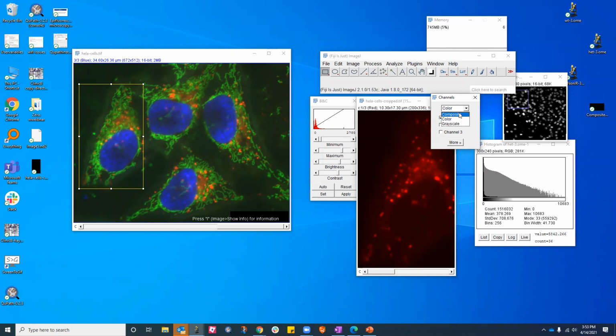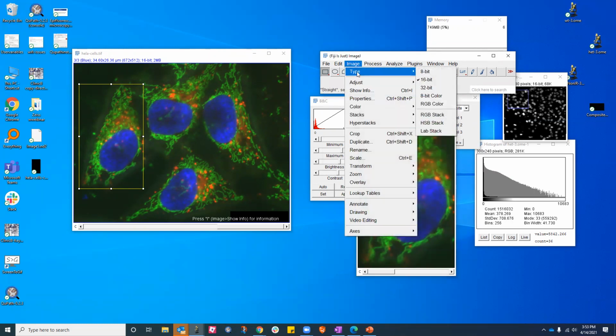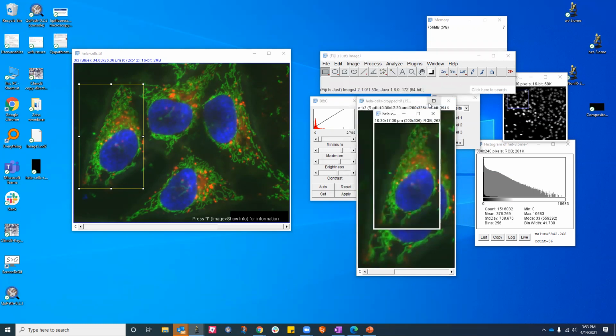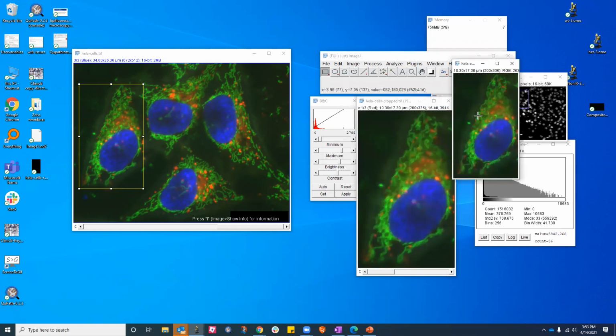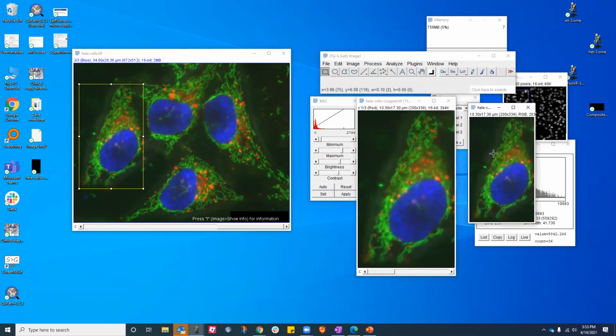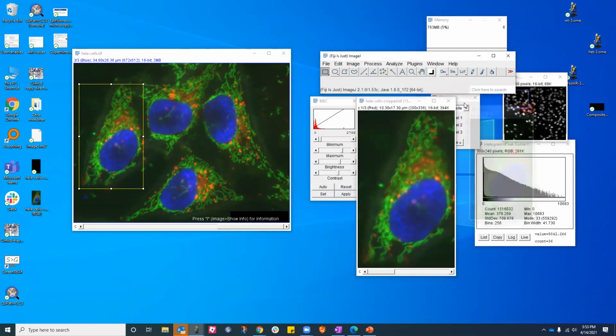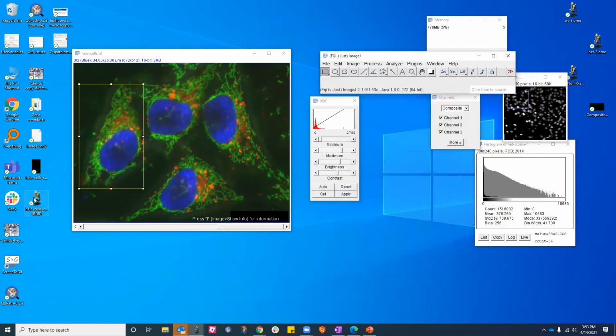So what if we want to save them as a merged image, the way, when you use scans, it opens as an RGB image with red, green, and blue, right? So we can change the type of this image to RGB color, okay? And now it's just one image. So let me save this so you can understand that. All right, I'm gonna close both of them.